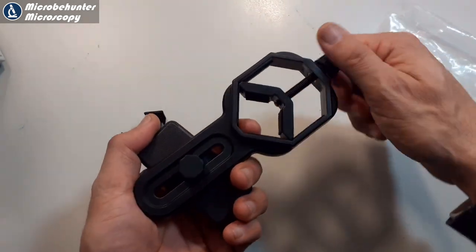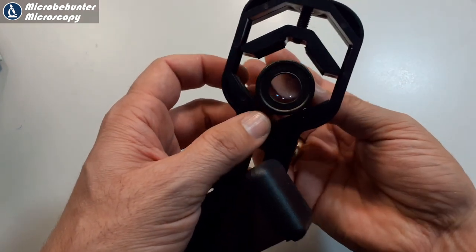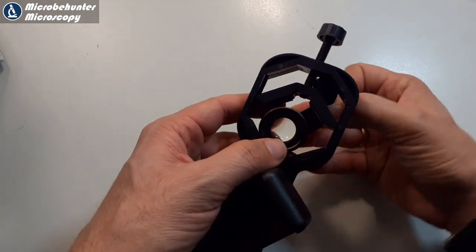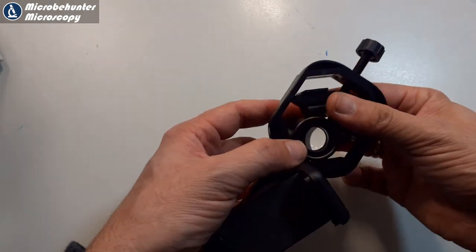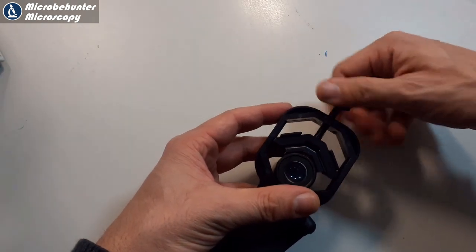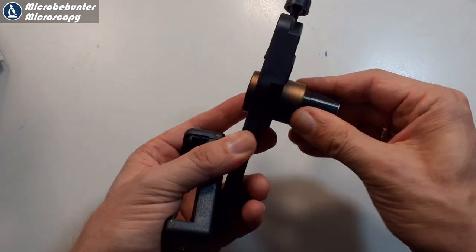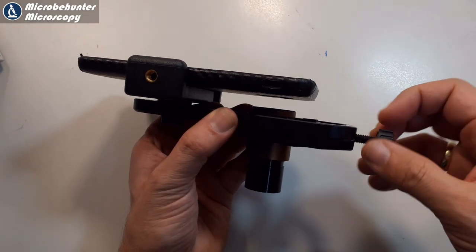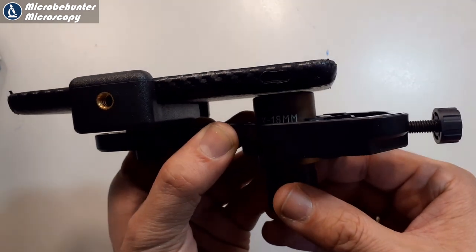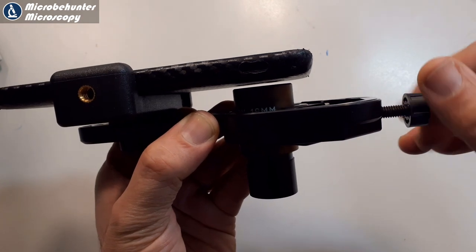There are two screws here - one of them for the mobile phone, the other one for the eyepiece - and here I'm just going to put one of these eyepieces in here simply to check. This is also an adapter for a smaller eyepiece which you can clamp in here, and by turning the screw the eyepiece is compressed and it's a very solid connection. You can also adjust the distance of the eyepiece, so there is a lot of flexibility here and I'm quite sure that it fits many different sizes of eyepieces and also mobile phones.